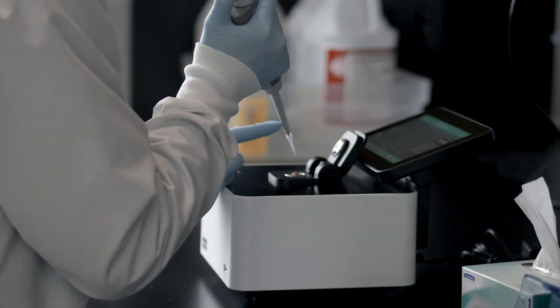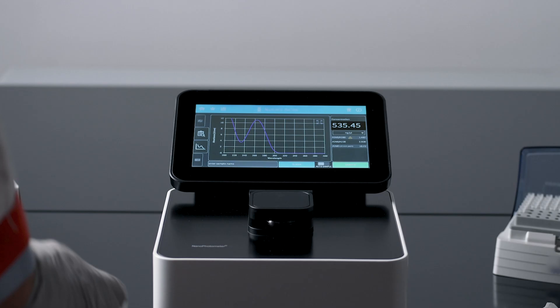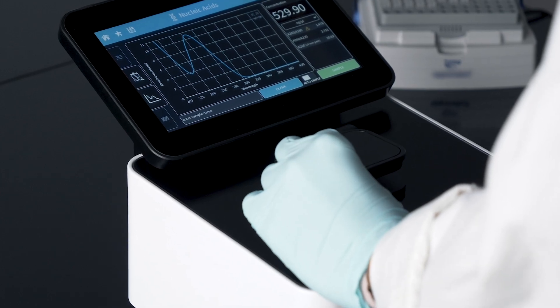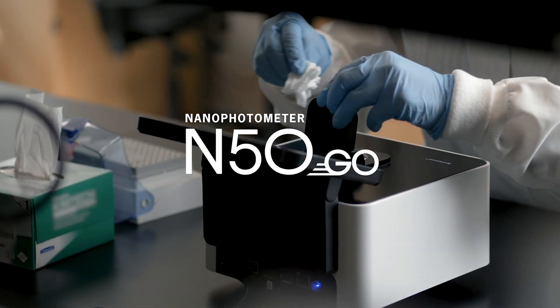Just to reiterate, this instrument scans samples — amongst other things. The Implen N50 Go!